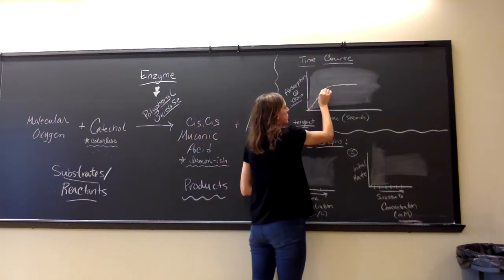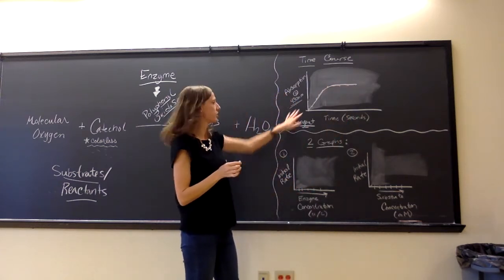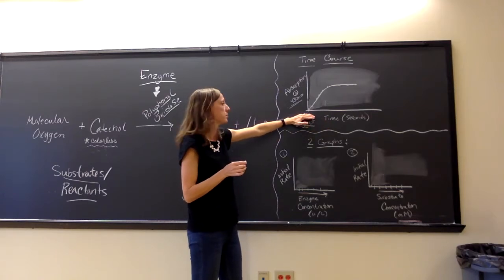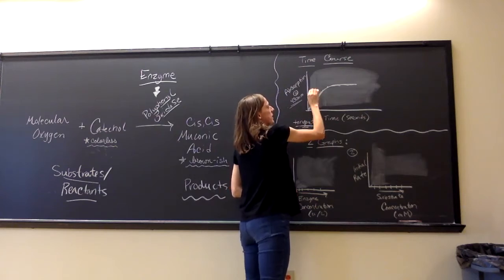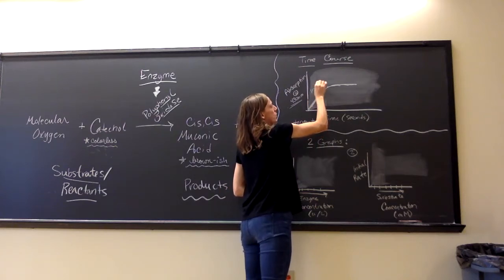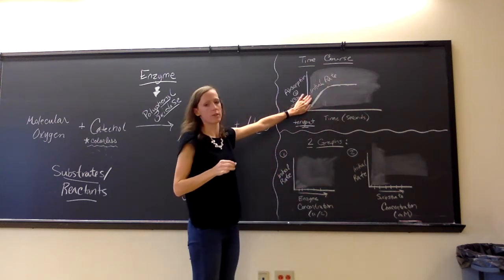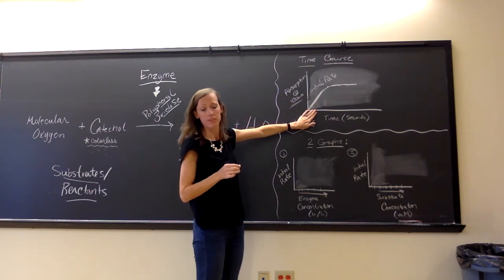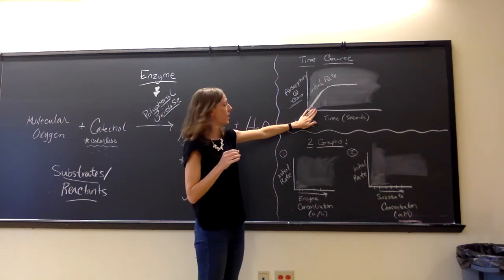And then after time has passed, it starts to level off, okay? Reaction is still happening, but not as quick of a rate as it does in the beginning, okay? And so this point here at the beginning, we term the initial rate, okay? Makes sense. The initial rate, the rate at the start, okay? And so we can actually get a number to put to that, the slope of that line, by using a tangent button that's on the computer. And I'll show you this as we get to that portion of the lab.